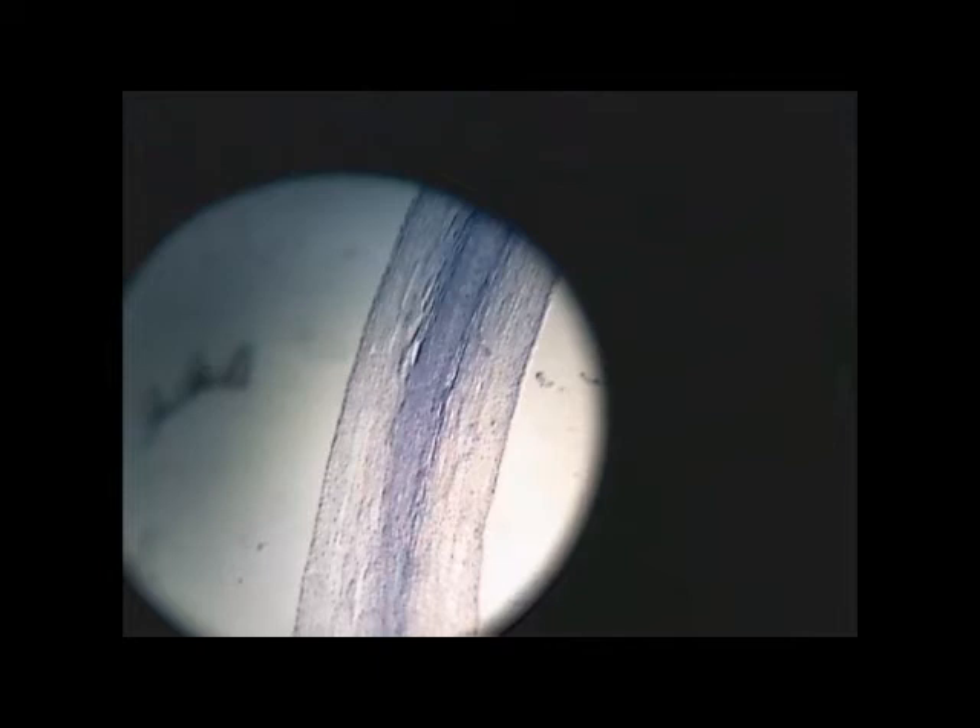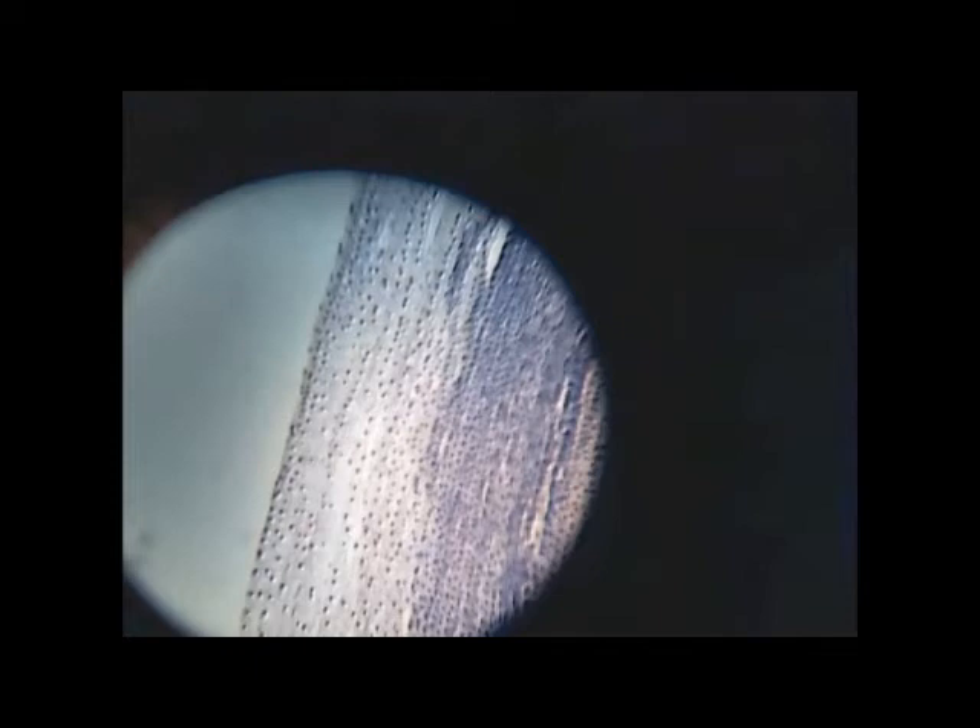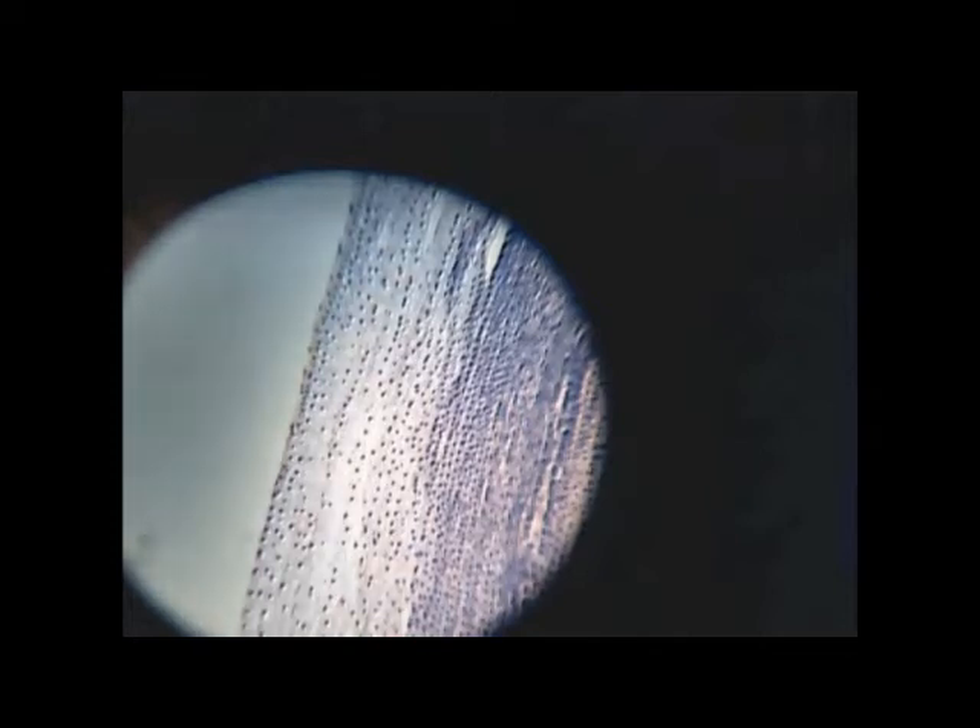Let's switch the microscope to medium power. I'll adjust the fine-focus knob — there we go. You can see a little bit of nucleus already. You can see the highlight of the dot — that's the nucleus. Let's play around with the software; I can add more contrast back and forth.